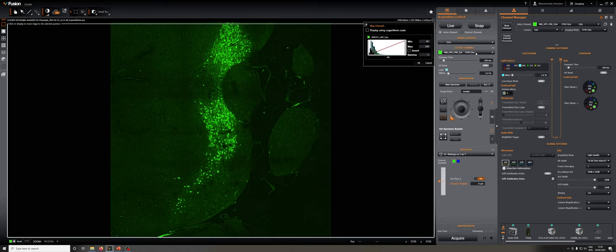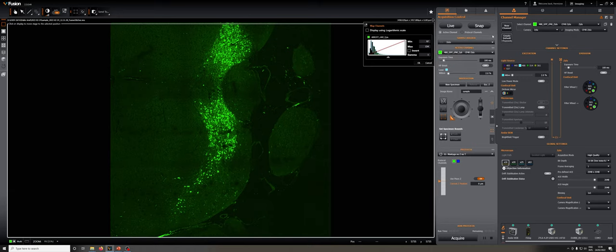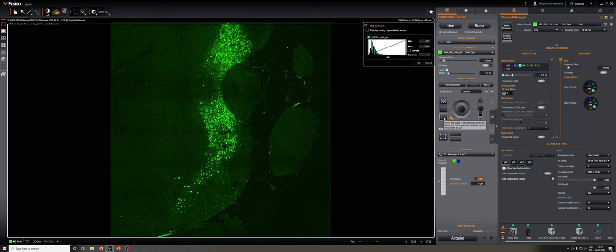There are a few other things we can do here. We can change the kind of sample holder — we'll go over this in a separate video discussing how to use multi-well plates. We can snap images, change the image name, and there are a few other controls I'm not going to go into in much detail. Since we don't want to move around anymore in the sample, I'm going to turn this off so that when I click on the image, I don't accidentally navigate to wherever I clicked.